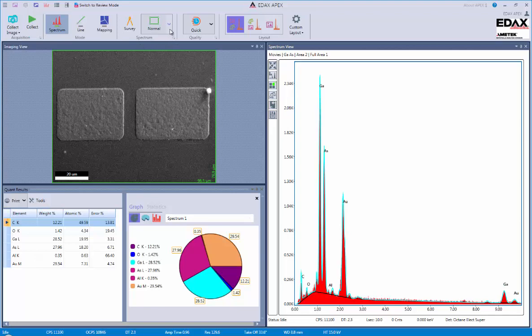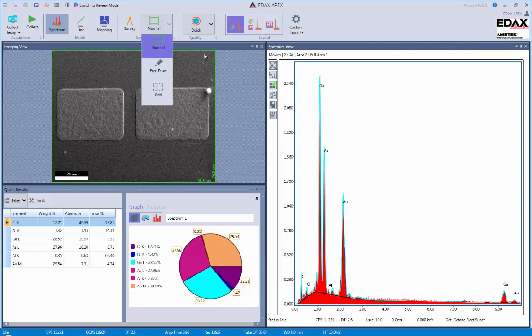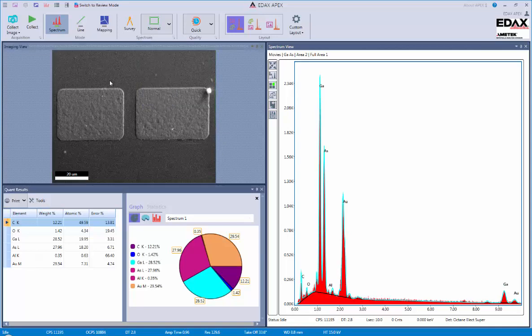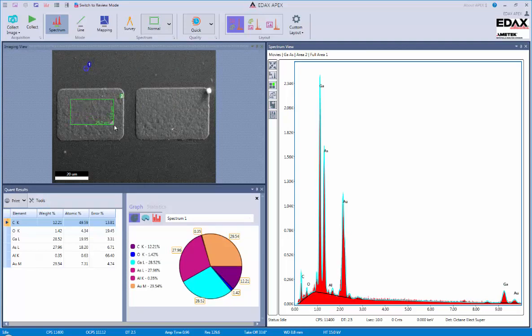A few of the other options are selecting what type of spectrum we collect, whether we select from a normal rectangle or a freehand draw or even a grid of areas. Now, you can also individually select points by either clicking on a single point or clicking and dragging to draw a box.